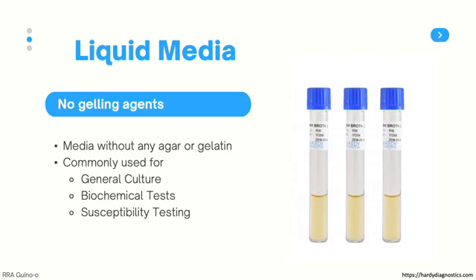The first type is liquid media, and these are media that contain no gelling agents such as agar or gelatin. The most common use of this kind of media is general culture. However, there are also some biochemical tests and susceptibility tests that employ liquid media.